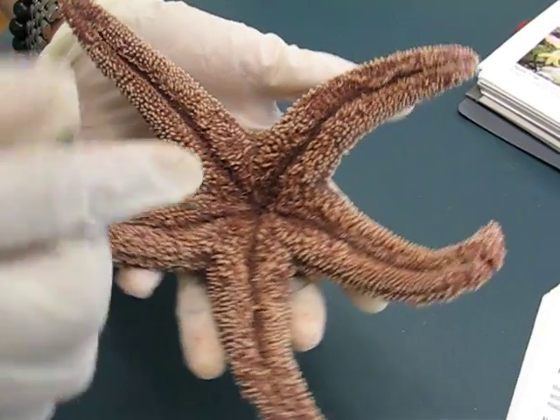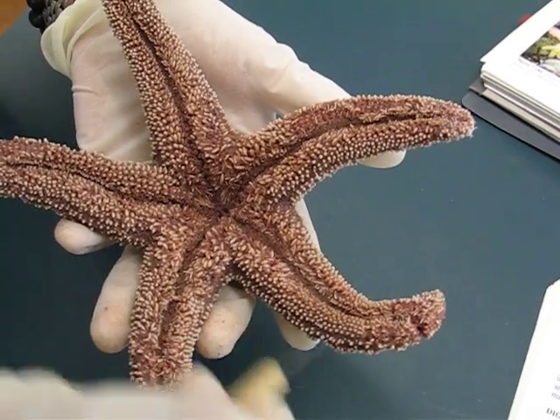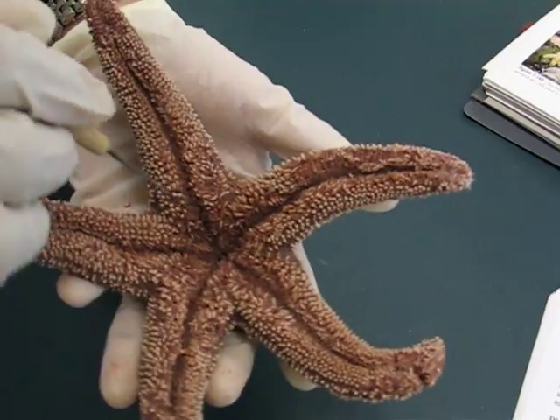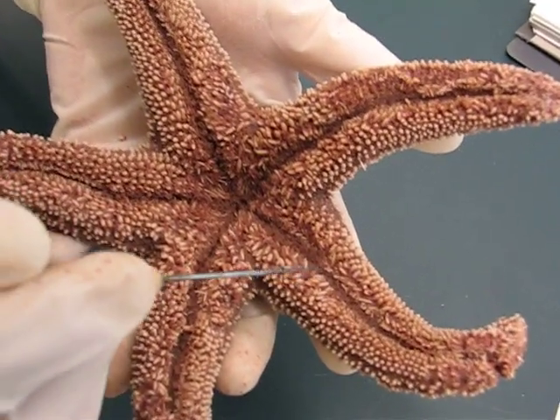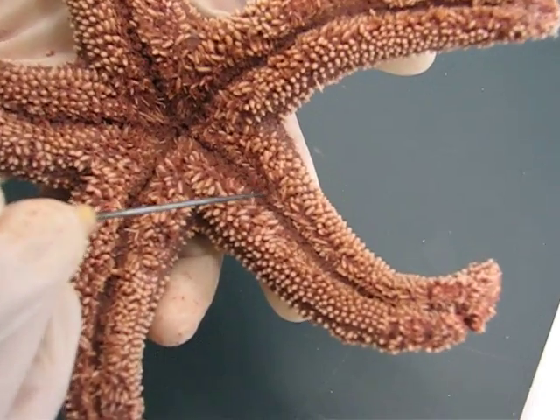The ambulacral grooves — the ambulacral grooves are these lines over here, these grooves. And we have the tube feet, which are retracted in the ambulacral grooves.